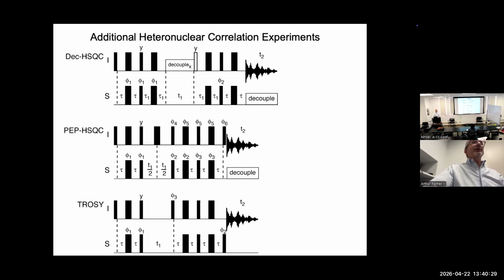But during the T1 period, the relaxation is the average of the relaxation for the in-phase operator and the antiphase operator. And unless the protein is highly deuterated, the antiphase operator relaxes faster because the Iz component is a proton operator and it interacts with all the other hydrogens. So, that's not so great. The signal is decaying.